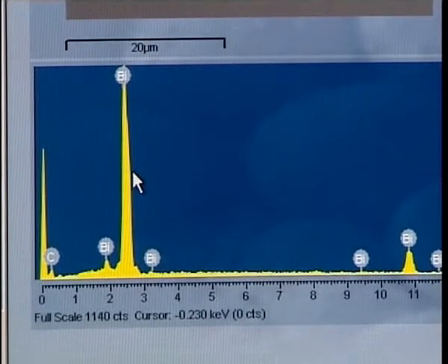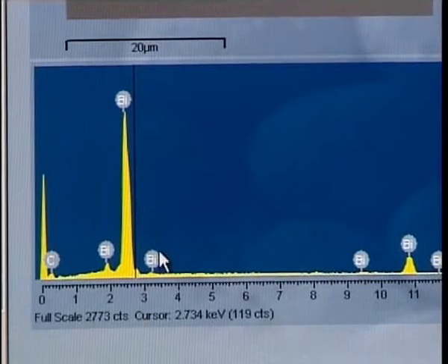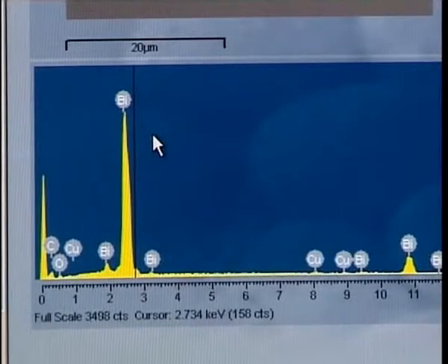The energy is specific to the particular element that the pigment contains. And we can see that this pigment contains bismuth and therefore identify it as bismuth metal. This is in fact an extremely rare pigment which has only been found in paintings of the early 16th century.